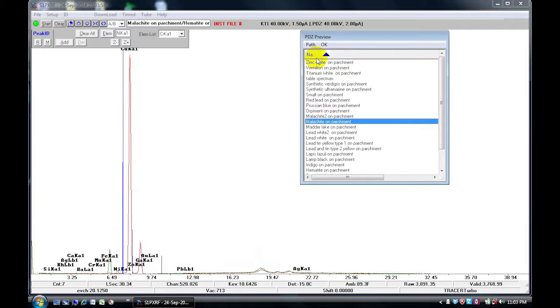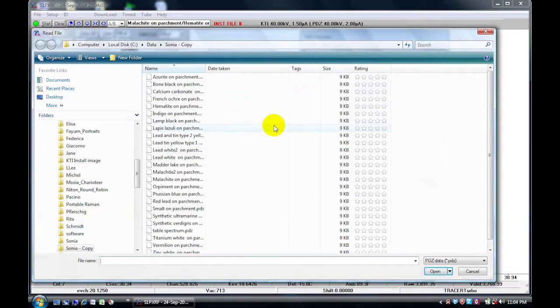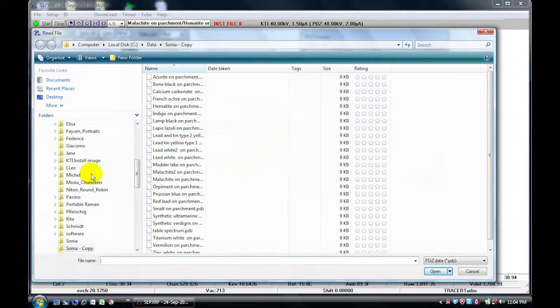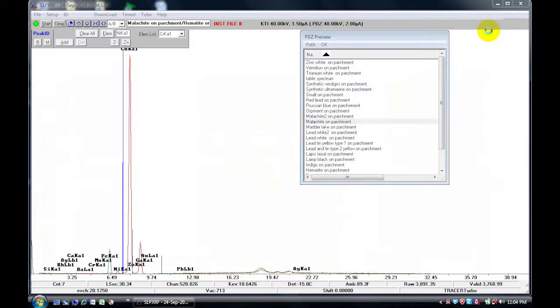If you want to compare spectra that are not in the same folder of the current folder, then go to Path and choose the appropriate folder. Once you're done with that, you can hit OK.